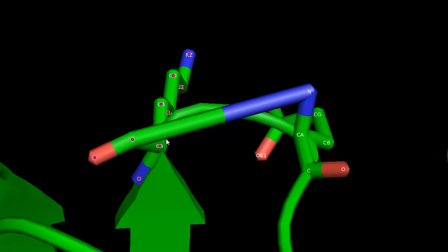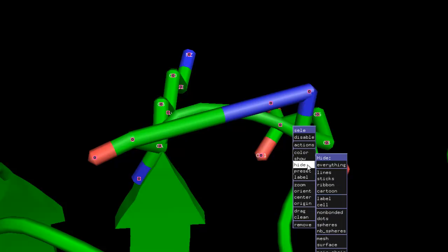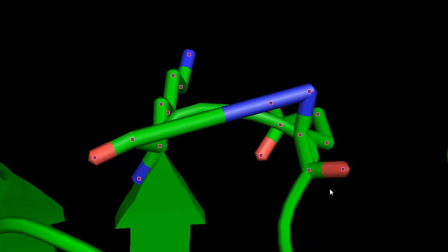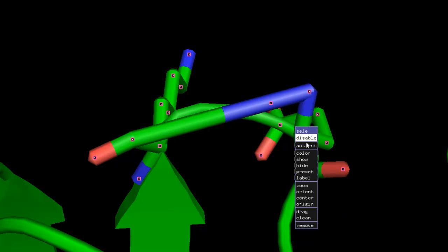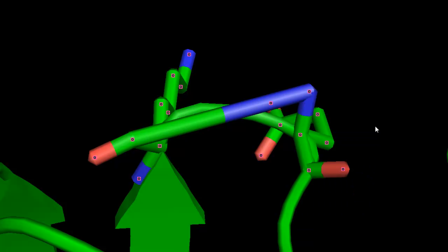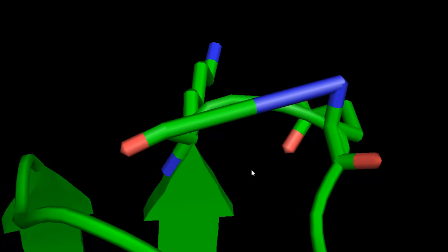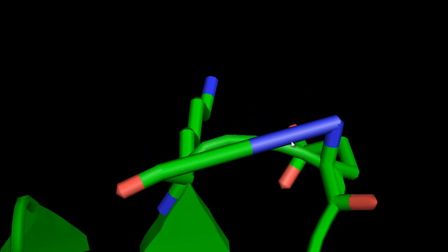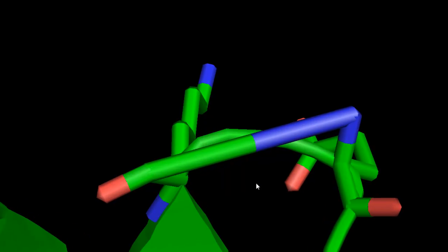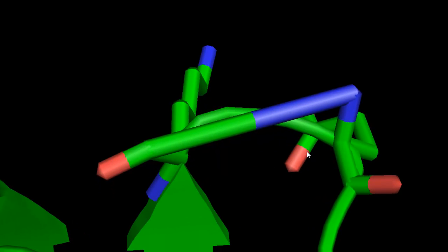Now, to make this clear, we can select these two residues, right click, and hide labels. But before I get to that, this is the issue I talked about at the beginning of this video. As you can see, this peptide bond is unusually long, and that's basically the limitation for this program.